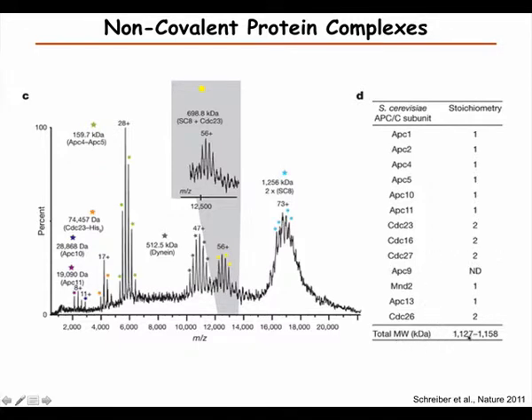And here we're used to very exact molecular weights, but now when we measure these very high molecular weight complexes, we have quite much larger uncertainty. The reason is that you see that there are a lot of peaks that are not very well resolved, and we often have adducts. So that's what makes it a little bit more difficult.